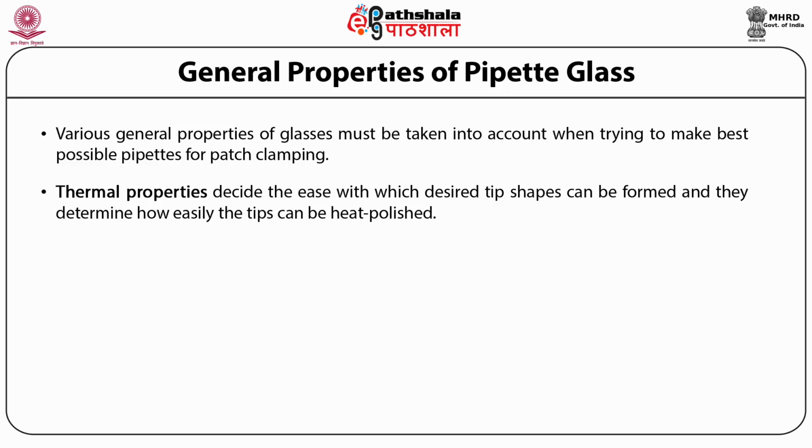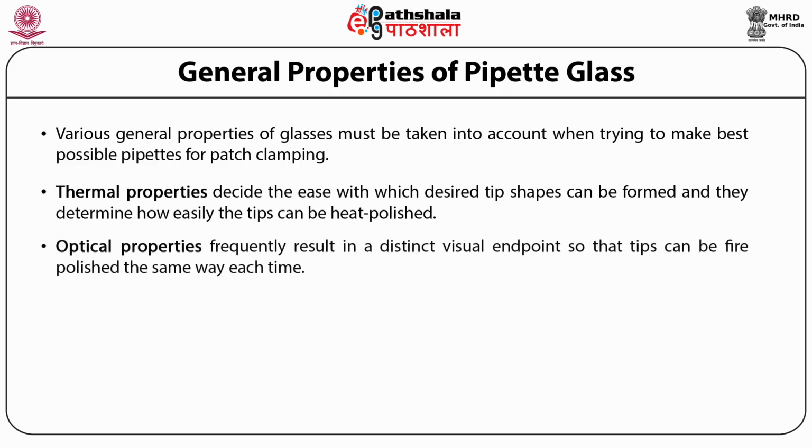The next one is optical properties. Optical properties frequently result in a distinct visual endpoint so that tips can be fire polished in the same way each time.